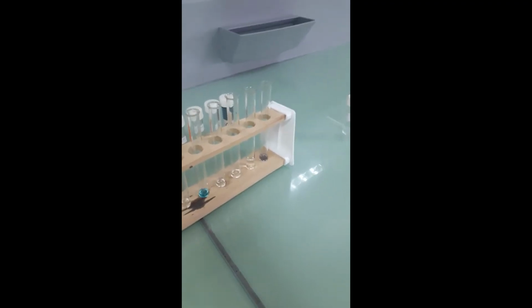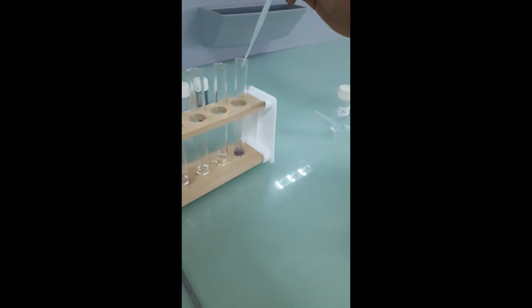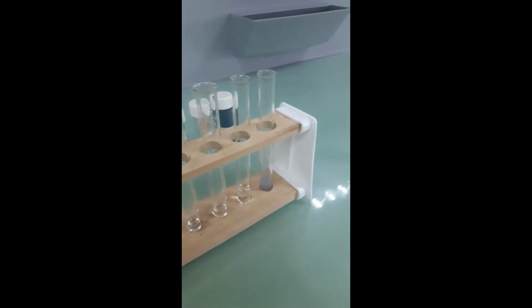So now we're going to do the second test with the cations using ammonia solution. In this test tube I have Cr3+ and I will be adding a few drops of dilute ammonia. Now in this test tube, I have Zn2+, and I will also be adding a few drops of dilute ammonia.